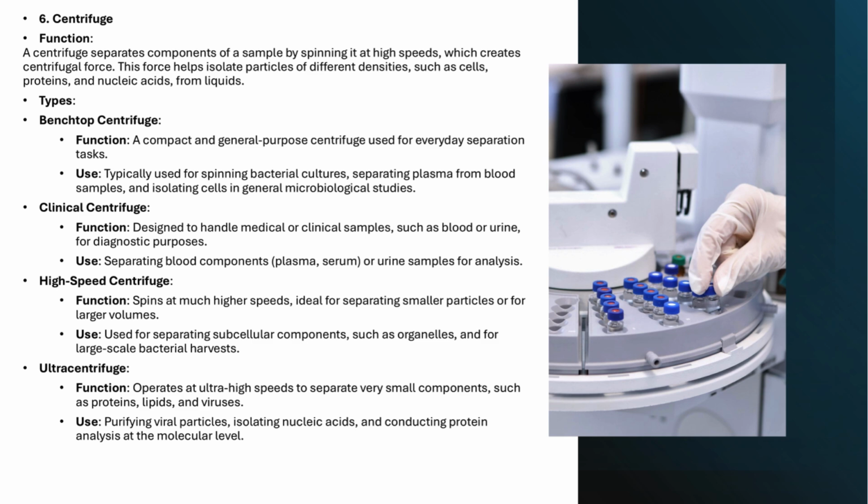Next up, we have the centrifuge. This powerful machine is used to separate different components of a sample by spinning it at high speeds, creating a centrifugal force that isolates particles of varying densities.